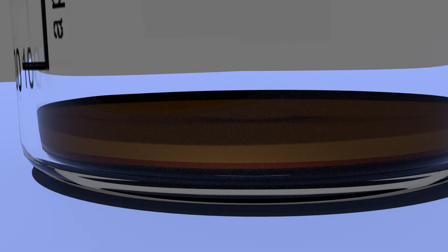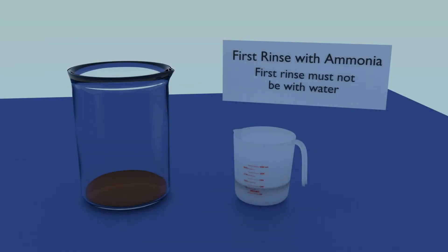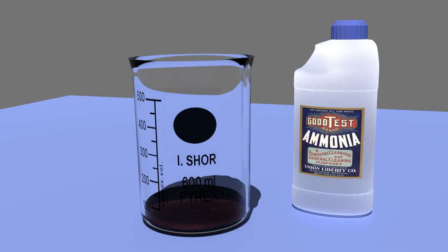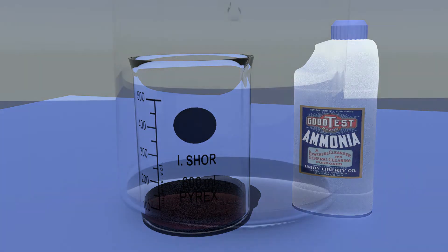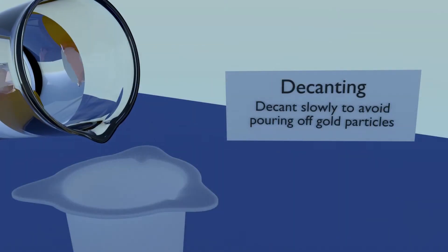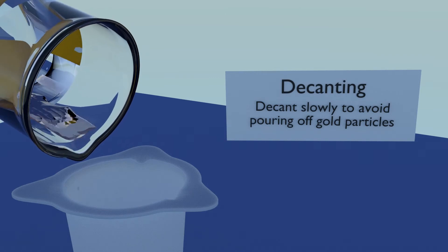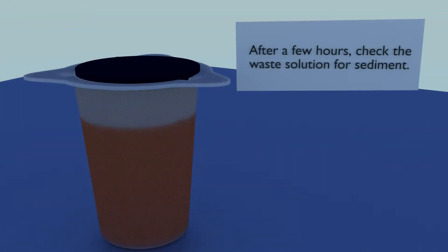Let's give the gold mud a thorough rinsing now. Any acid clinging to the mud will have dissolved metals in it, so a thorough rinse is essential. The first rinse is with ammonia. You don't need much, and regular household ammonia is fine. Add enough ammonia to cover your mud. Let the gold particles settle and then decant the ammonia, being careful not to pour off particles with the ammonia. Save the solution so that you can check it later for particles.